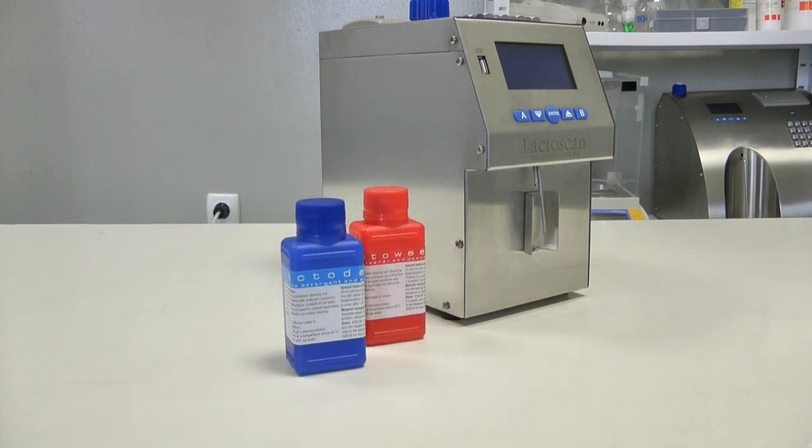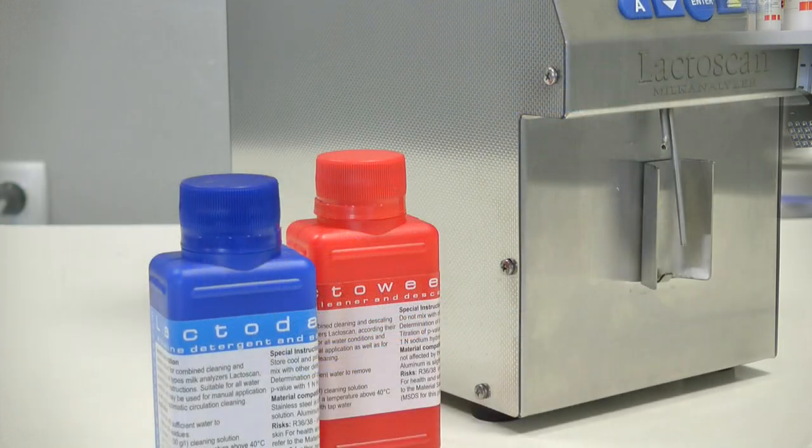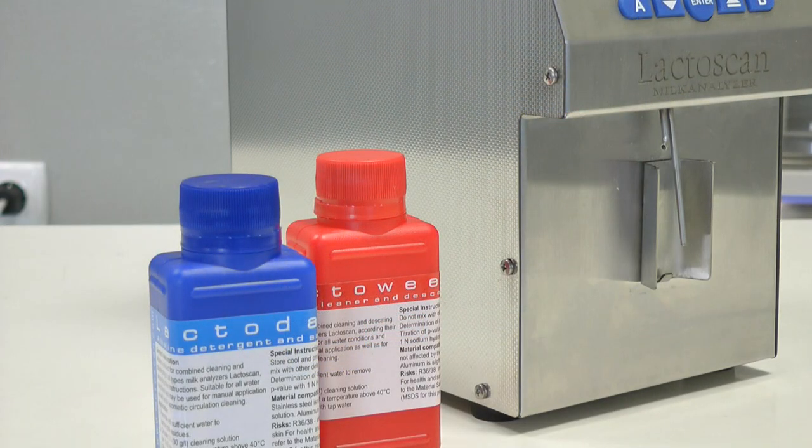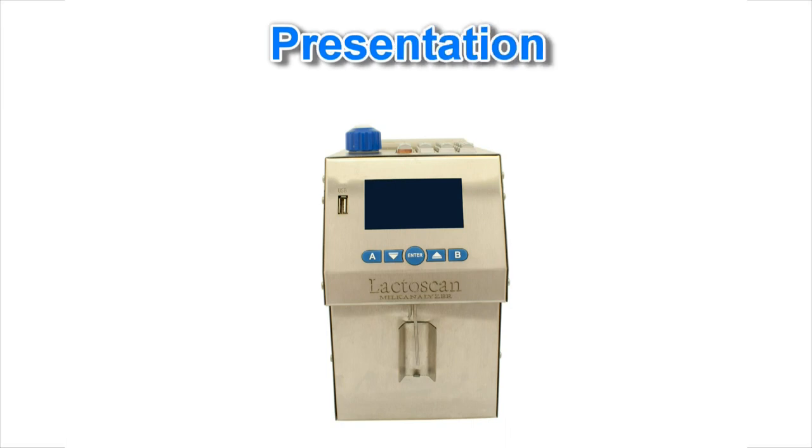These are the two concentrated cleaning solutions: alkaline, lacto daily, and acidic, lacto weekly. Let's return to our device, lactoscan S.